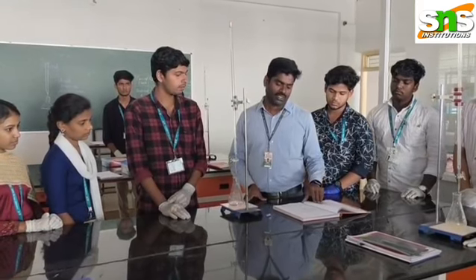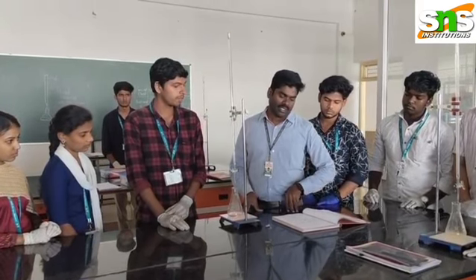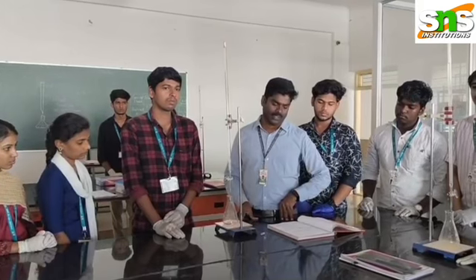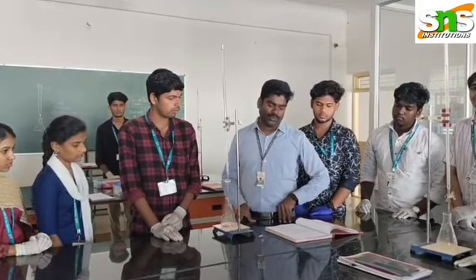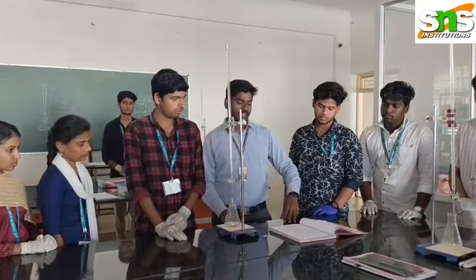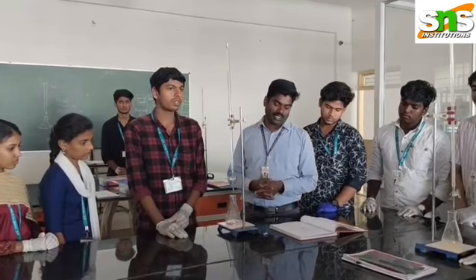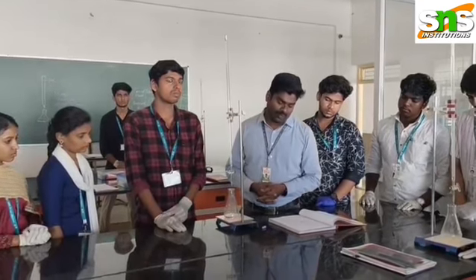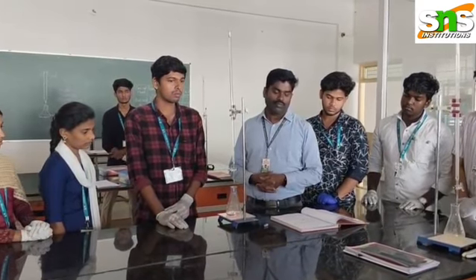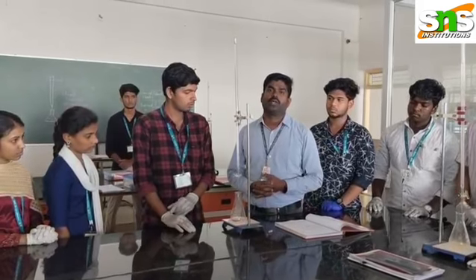Here V1 is the volume of sodium carbonate, only 10 ml. N1 is the normality of sodium carbonate, we prepared 0.1 N. And V2 is the volume of sulfuric acid, the titre value we got here. So finally we found N2. We got approximately 0.0943 as the answer.